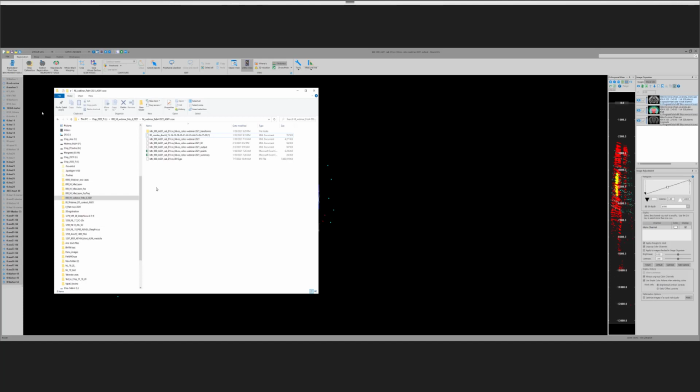After you hit that Map Data to Atlas, the program generates a number of additional files. Every case that we do, I have in an individual folder. The individual folder contains a file that has the original image. It's a JPX file, which is the original stack of serial sections through the brain that have been aligned. That's the largest one because it's the original images. Then there's a data file, saved in an XML file format, and this is the file that contains all the marked cells.